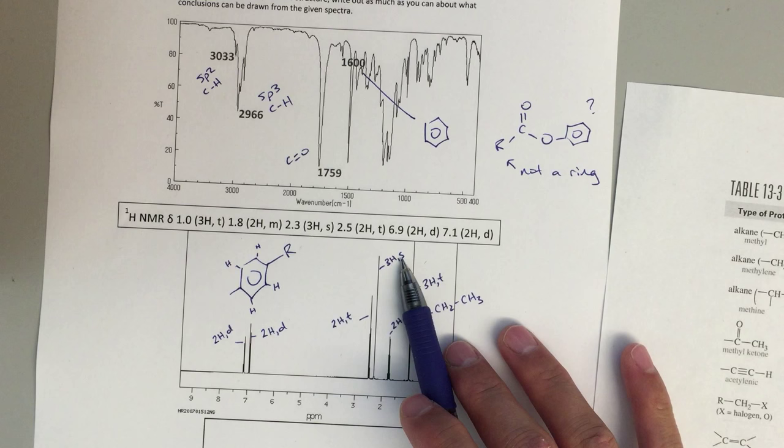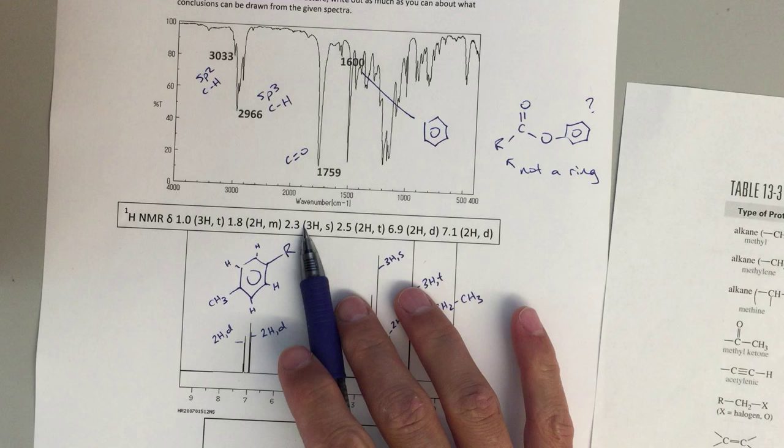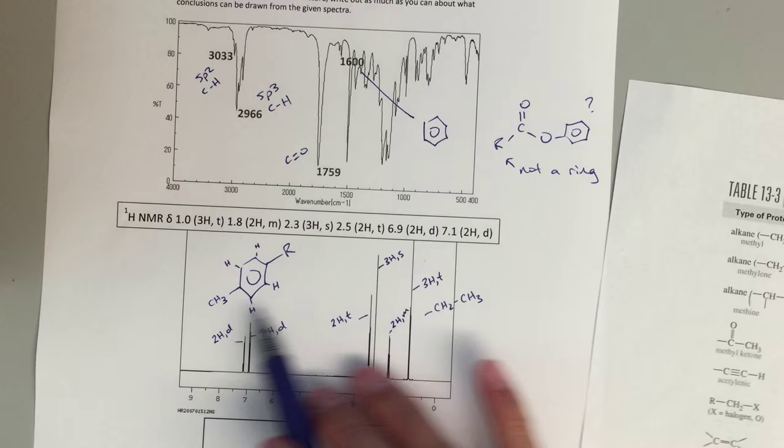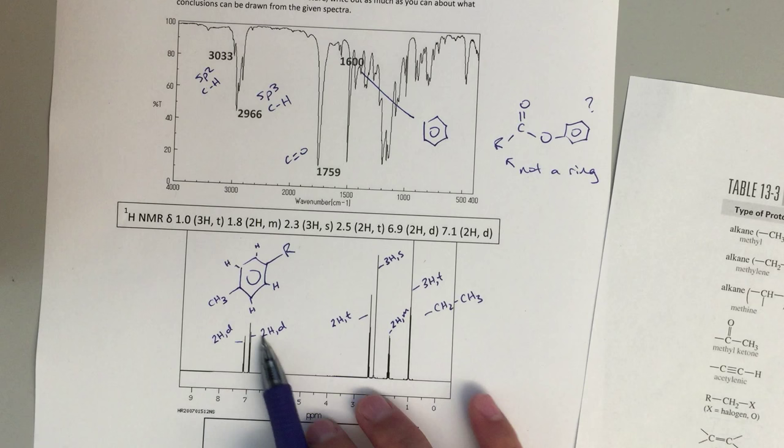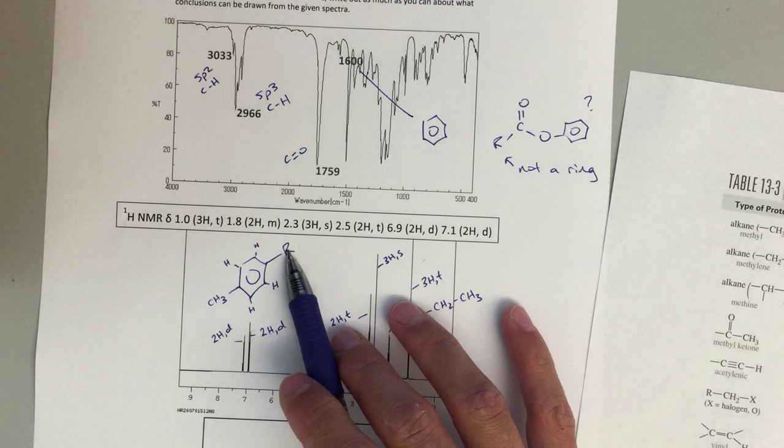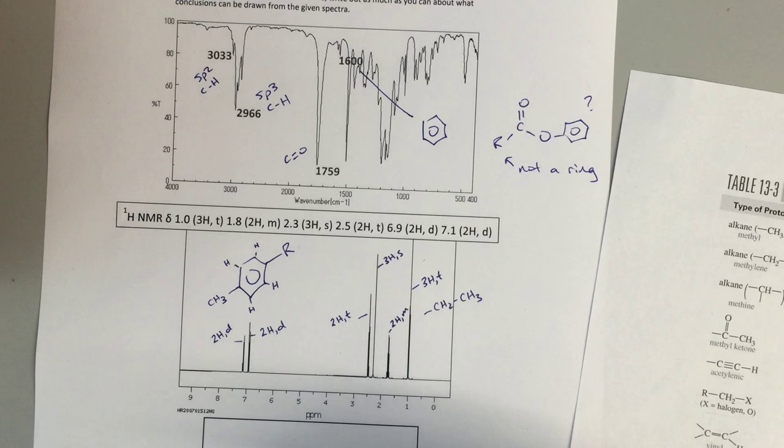Now this reminds me of this 3 high singlet. And that 3 high singlet could be a benzylic, a phenyl methyl. So a phenyl with a methyl group on it, and that comes at approximately 2.3. So my 3 high singlet is exactly at 2.3. So I'm going to put a methyl group here. I really think that matches up nicely where I would have an R group coming off here. 3 high singlet would be my methyl group on that benzene ring. That matches up really nicely. These are clearly 2 high doublets on that ring. So I've got that mirror plane here. I think something like this is definitely part of my structure.